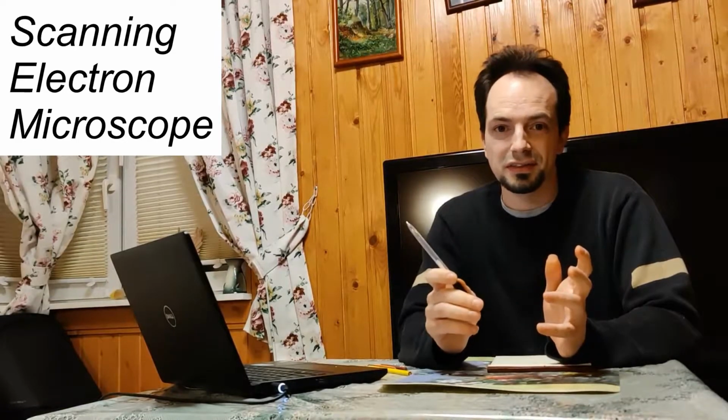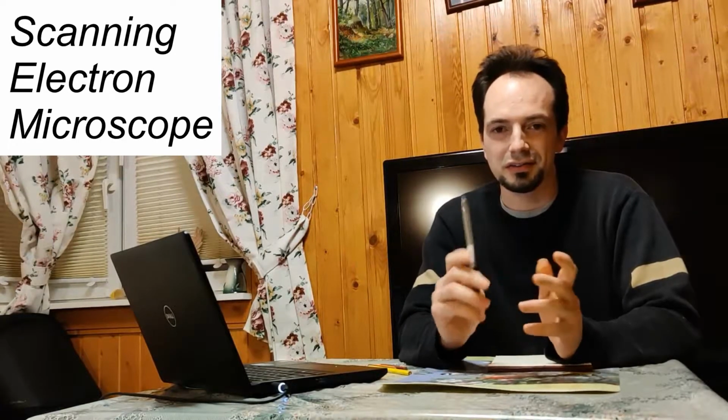They are obtained by a device called an electron microscope, and in particular a scanning electron microscope, or SEM. That's the theme of today's lecture, the scanning electron microscope, SEM. I will try to give you basic information on how it works, what the main principles of operation are, the basic device construction and parameters, and so on.